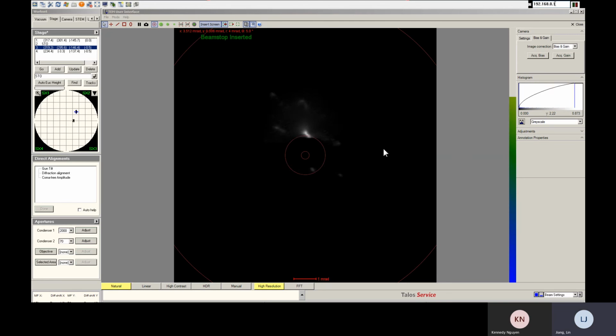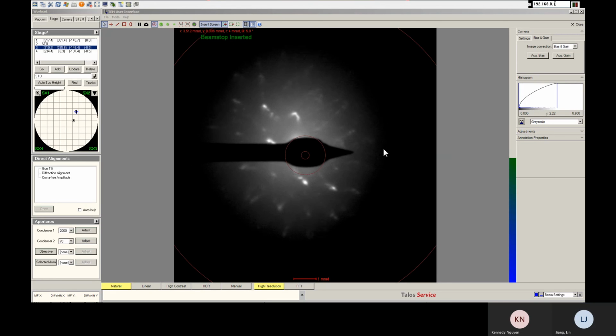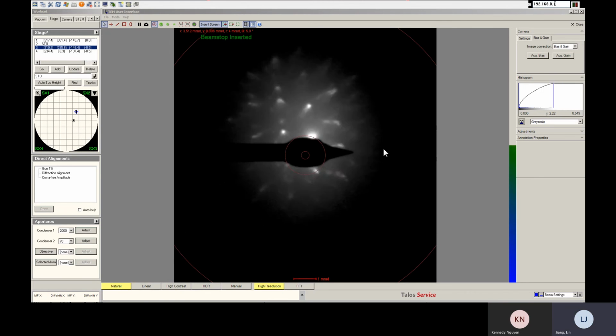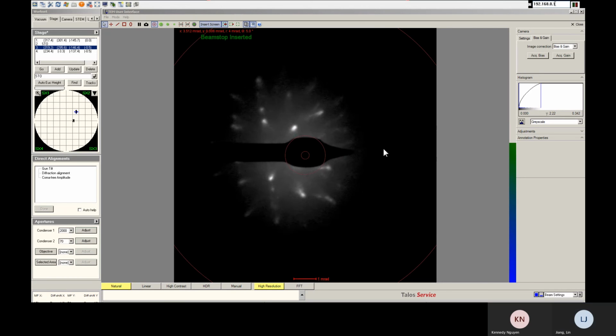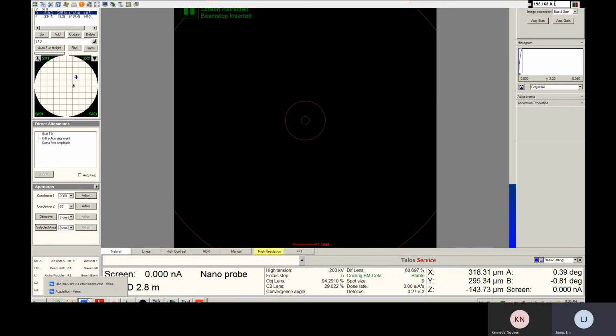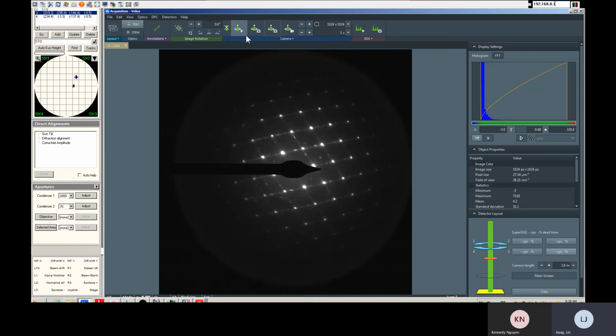This is your local information. Yeah, this is local information. It looks very weird. Then you can lift the screen, same method.